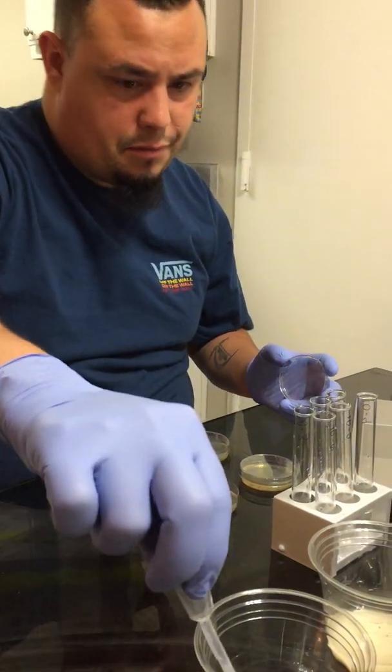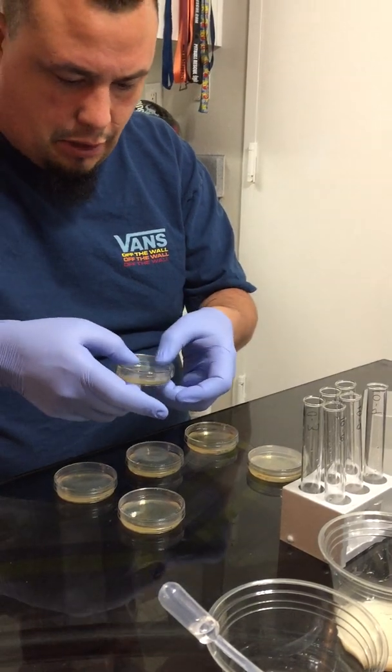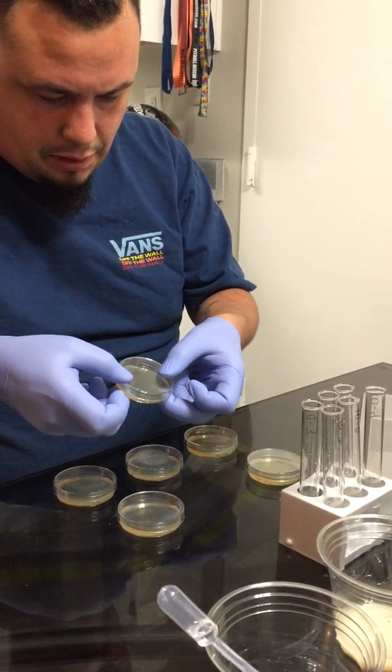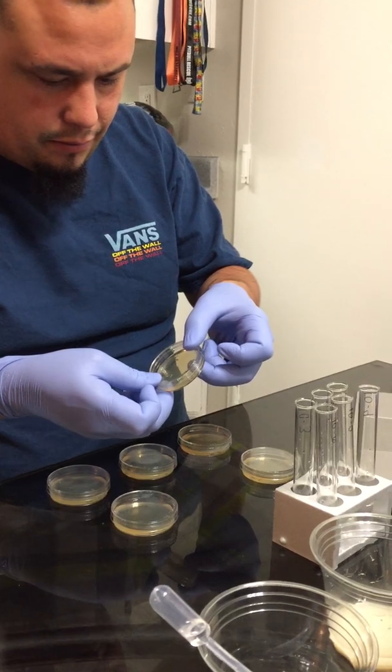Okay, 4 drops. And we will just gently swirl the plate, allowing it to evenly spread over the agar.